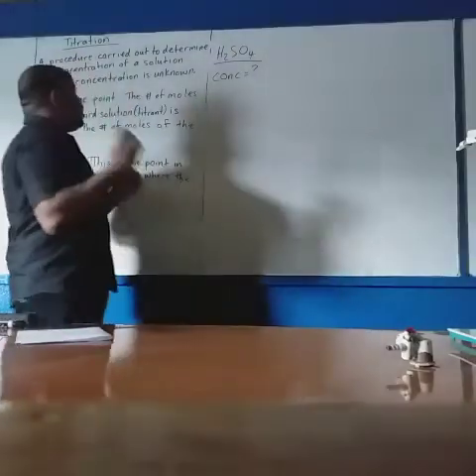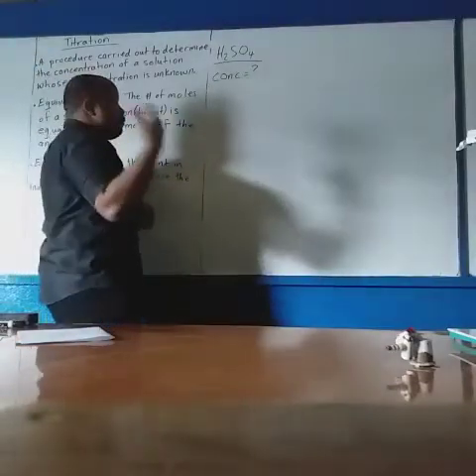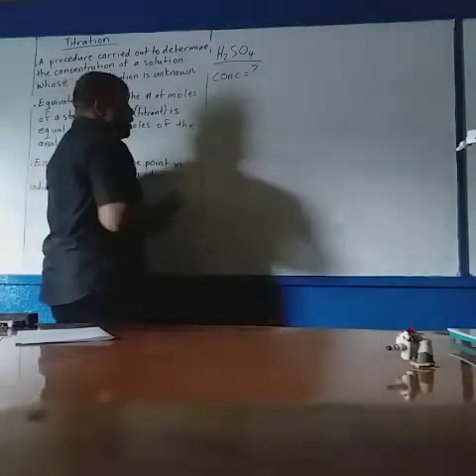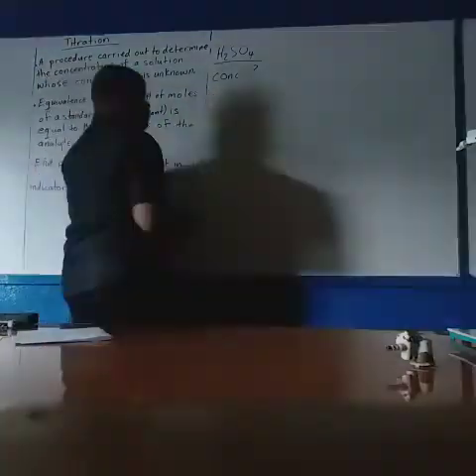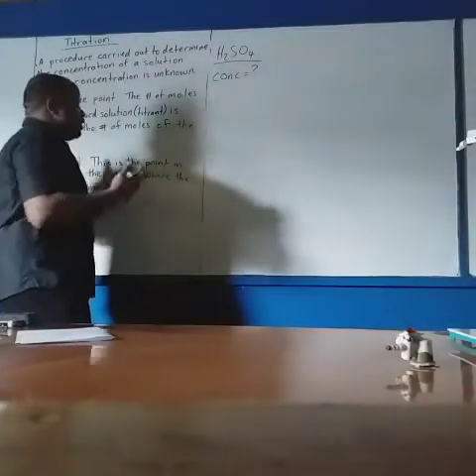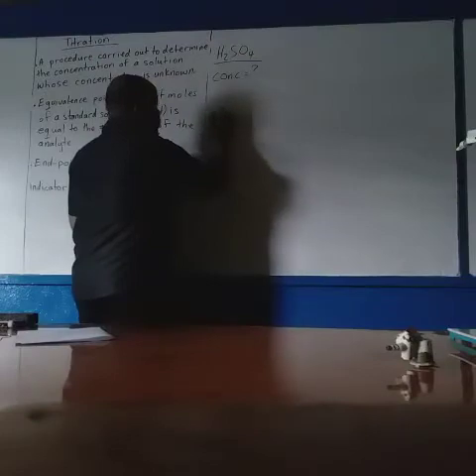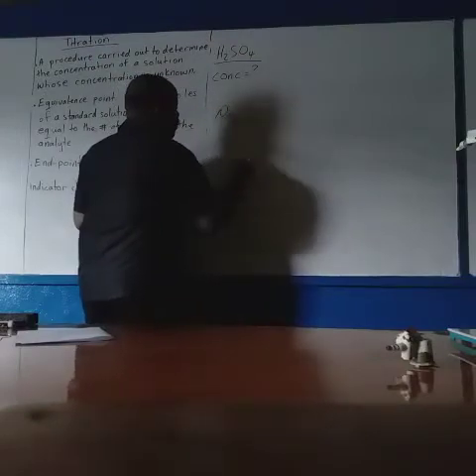Remember, we're looking at acid-base titration, so it is an acid-base reaction. You are provided with a solution of sulfuric acid, and you are asked to find its concentration. So we are going to use the titration technique. What I'm going to do is use a base, let's say sodium carbonate.